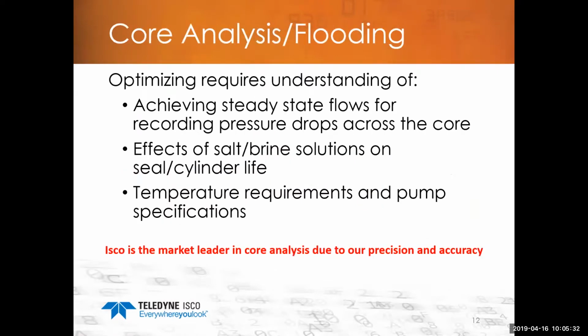When you're looking at core analysis and core flooding, when you're thinking about syringe pump technology, you need to understand that you have to have a steady state flow, but make sure you record the pressure drops all the way across the core. You're looking at the effects of salt and brine solutions on cylinder life and seal life, and then temperature requirements and pump specifications. You have to make sure you get those right. You can shorten the life of a syringe pump if you don't have some of the specifications set up right.